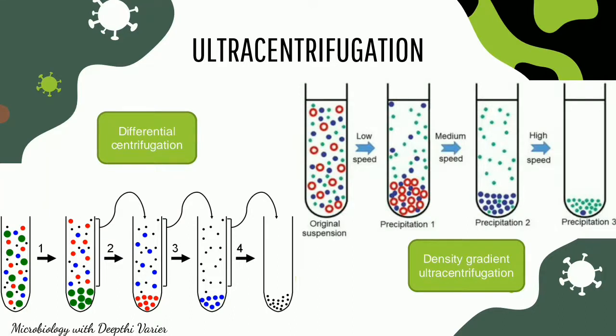The different centrifugation speeds often create separation of maybe not more than 2 or 3 fractions. So the supernatant has to be further taken for centrifugation. With each step, the centrifugation speed has to be increased so that we get the desired particles. That is the only difference here. The advantage that density gradient has is that because we are creating a density difference, usually with one centrifugation speed you can achieve your purpose, unlike in the case of differential, where you have to keep increasing the speeds.